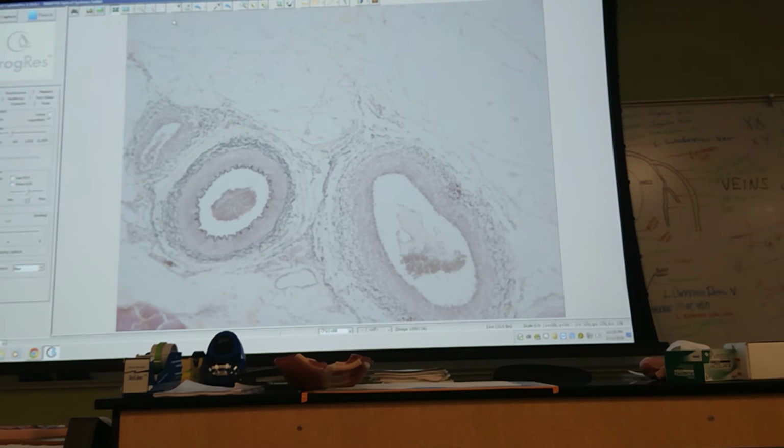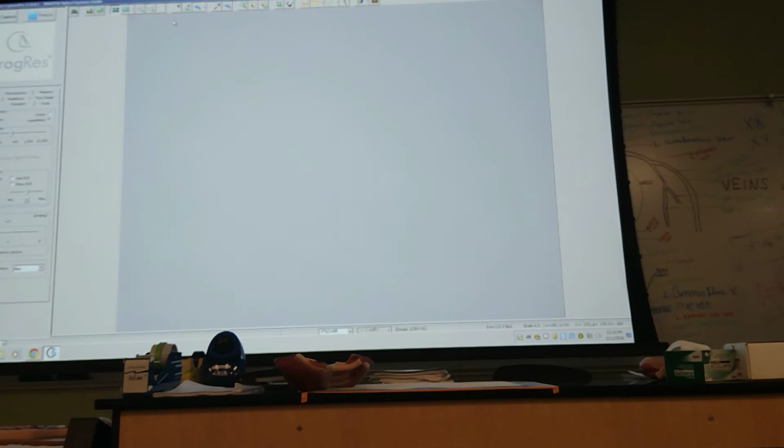So, it is the lumen, but pretty obvious. We've got much more interesting things. Okay? All right. We okay with artery vein? All right. The next one. Now we have three structures. The second one, go to page 8.